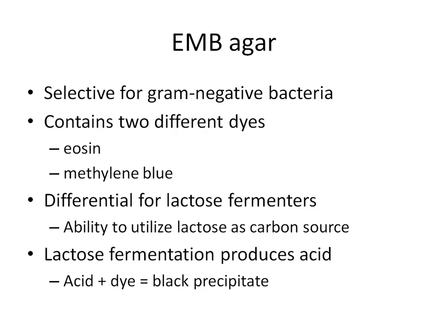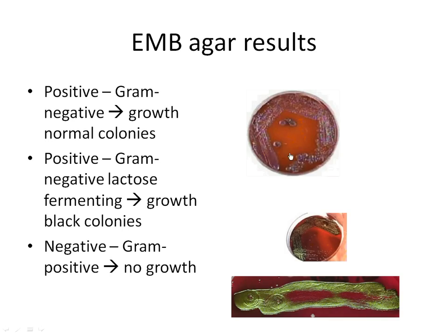Looking at the first EMB image: the EMB agar itself is a blood-red, almost purplish color. Bacteria is growing on this plate, so we know it must be gram-negative. In addition to growing, it shows a purplish-black color on the bacteria itself, which tells us that this bacterium is a lactose fermenter.